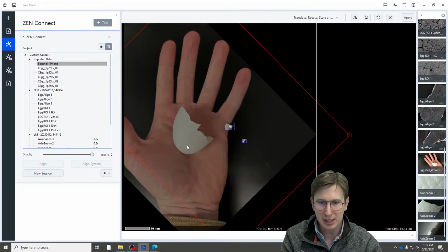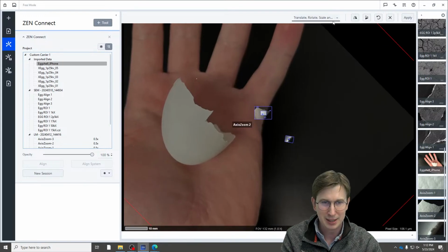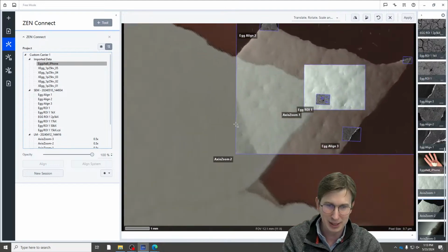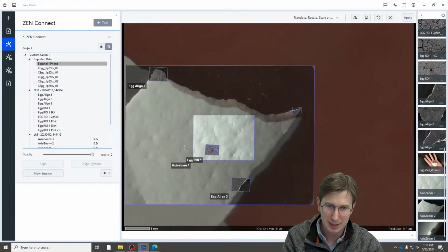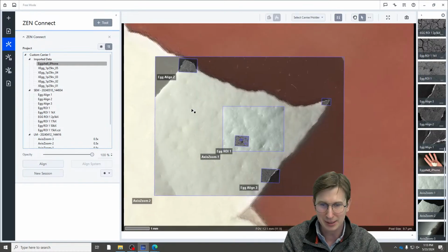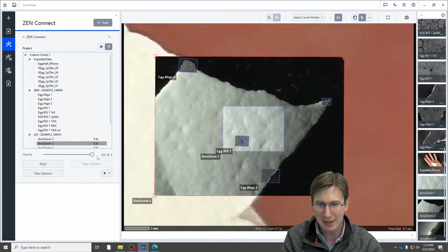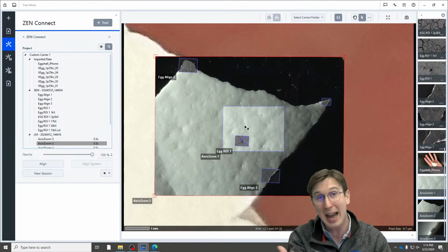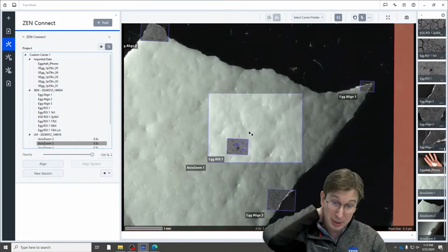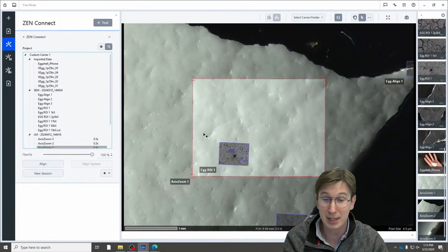This picture was much smaller. I needed to reposition it. So we have different tools that allow us to do that. And then this is really the process: see underneath, get it to fit, then you would be able to align those data. So that's how I was able to get that iPhone image scaled, because I had something that had the proper scaling.